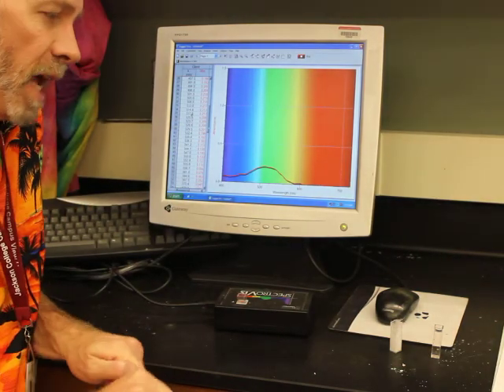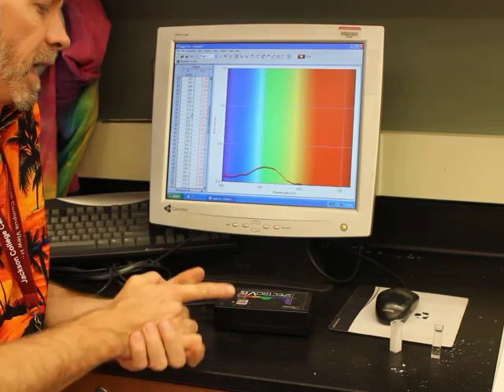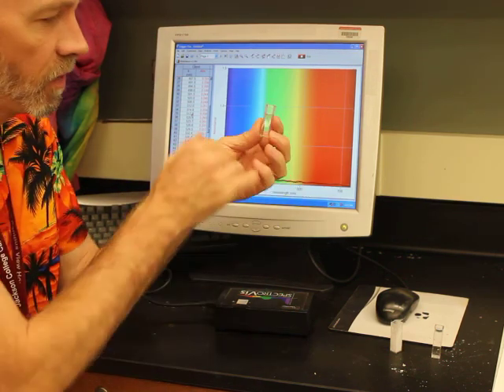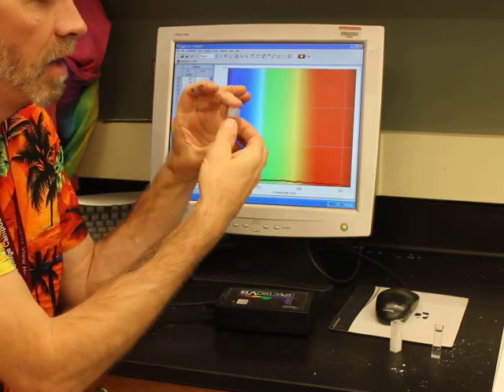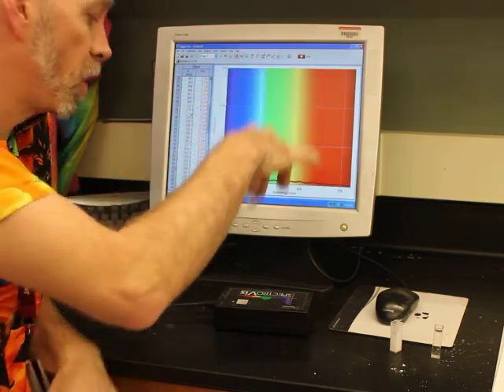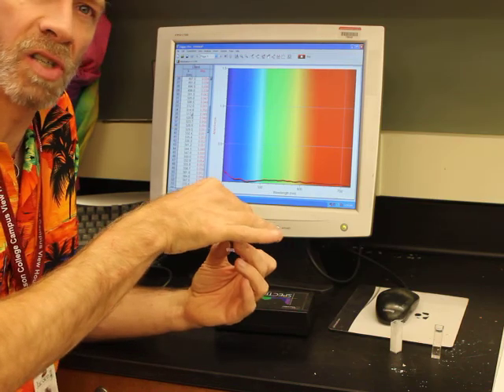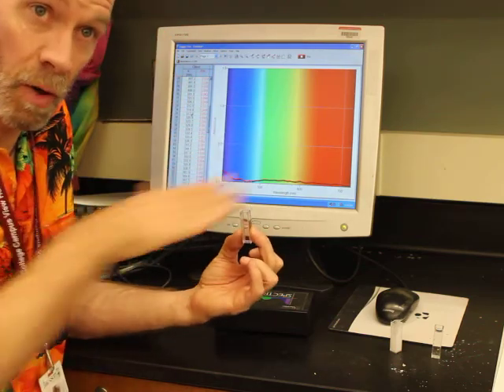Now we have another problem that we have to deal with. Quick side note, some of these cuvettes have a set of sides that you can see through, and the other side has a bunch of lines. It's almost kind of frosted, right? You need to make sure when you put the cuvette in that the light goes through the side that you can actually see through, right? The reason we have the frosted side is that's where you put your grindy fingers, and you never touch the sides that have the plastic that we want the light to go through.